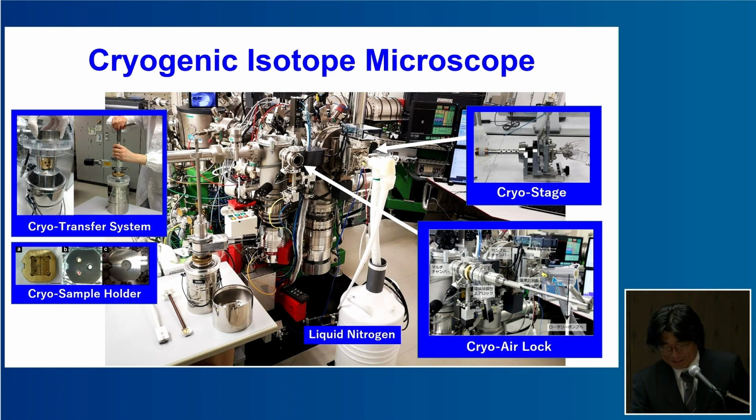I spent 10 or 15 years on this. Recently, we succeeded in developing a cryogenic isotope microscope consisting of these components. The cryo stage is cooled by liquid nitrogen, and frozen samples can be introduced into this machine without exposure to the atmosphere.